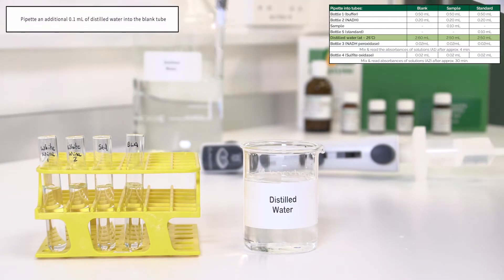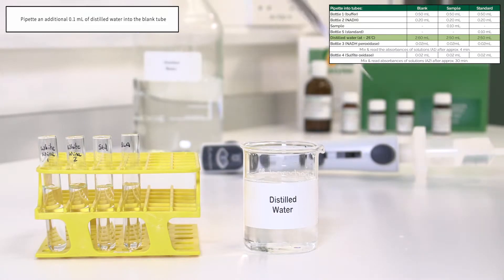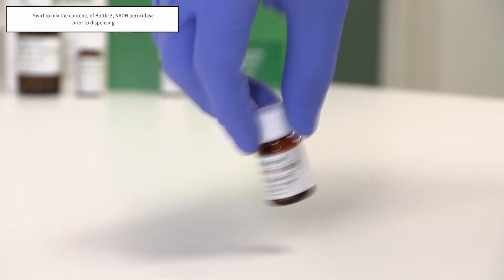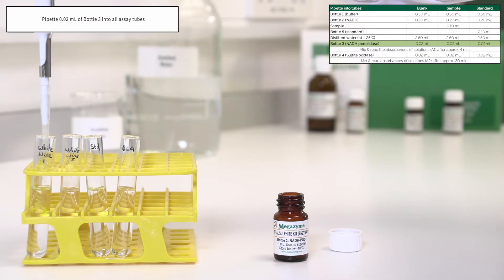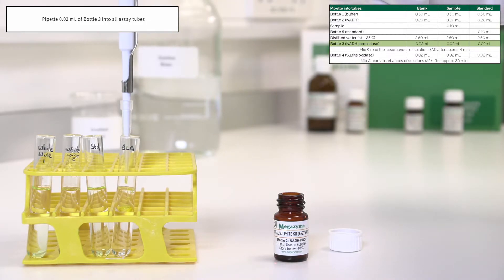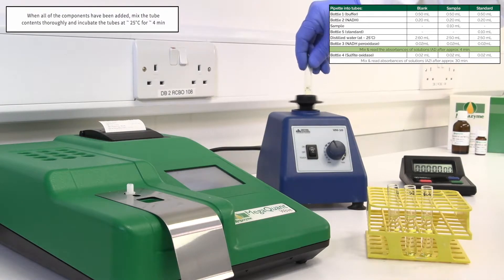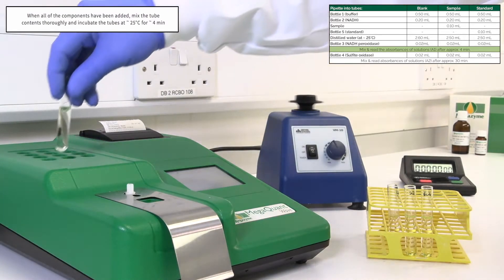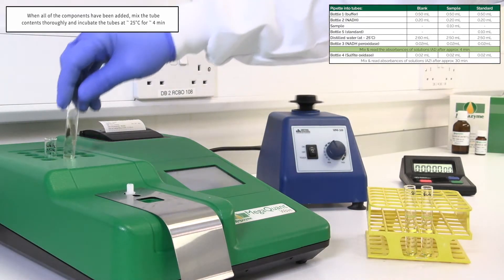Once all reagents have been added, mix the tube contents thoroughly and incubate the tubes at 25 degrees Celsius for approximately four minutes.